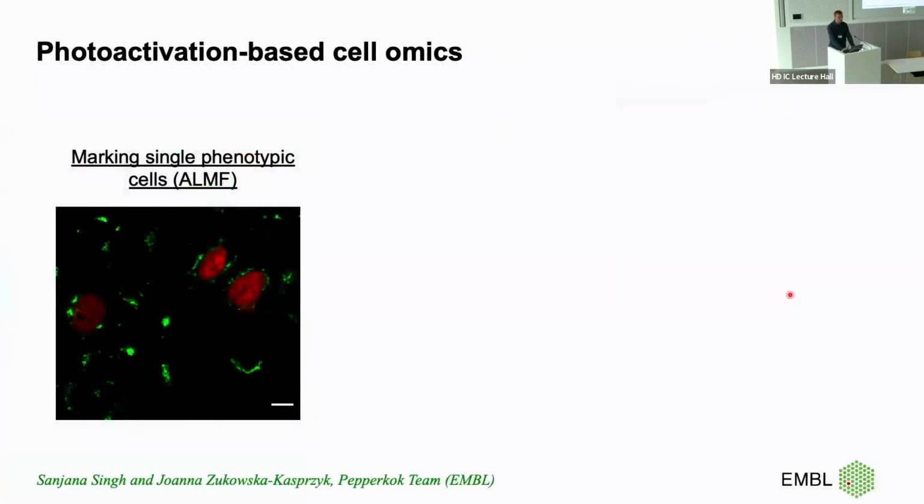So one of the projects is for single-cell transcriptomics. And I think this is remarkable because this is also how we combine the expertise of different facilities. In this case, the imaging is just the first step. We are interested in having cells which have a photoactivatable marker, in this case mCherry. In this particular project, people were interested in photoactivating cells which have a particular phenotype in a Golgi channel. So the green marker corresponds to the Golgi channel. They wanted to separate cells which have more compact Golgi from cells which have more fragmented Golgi, right?